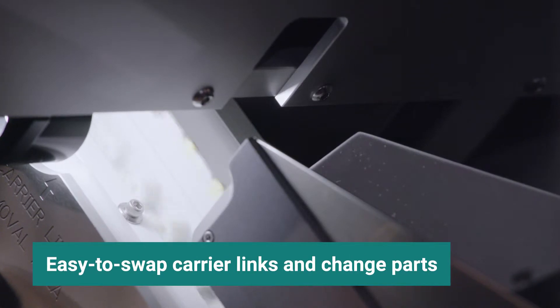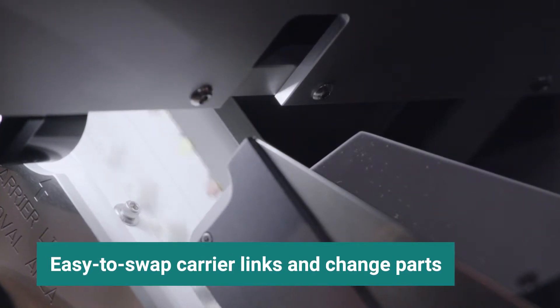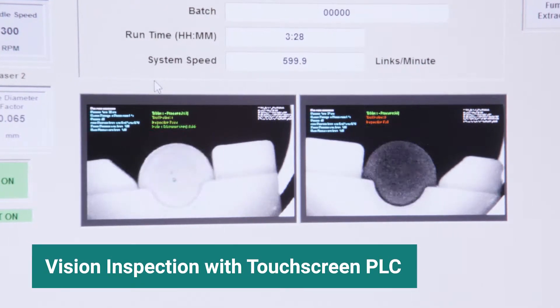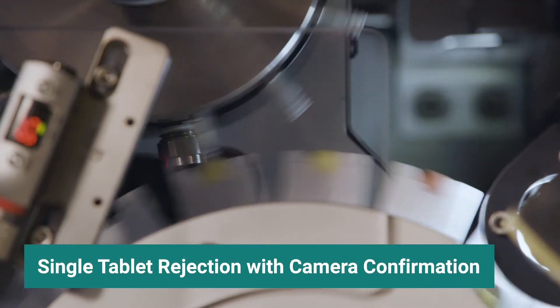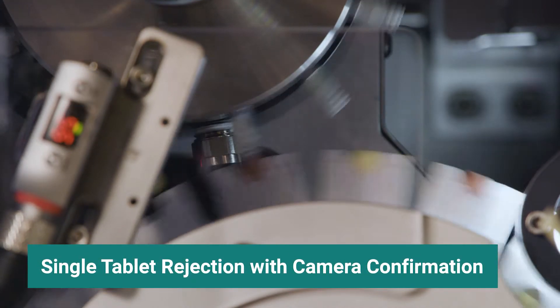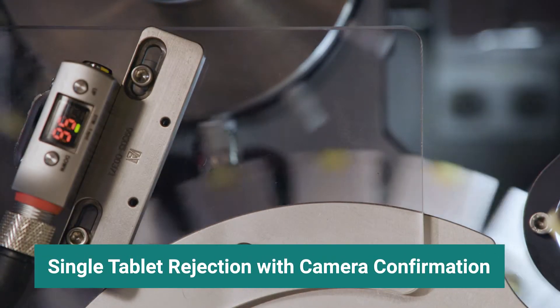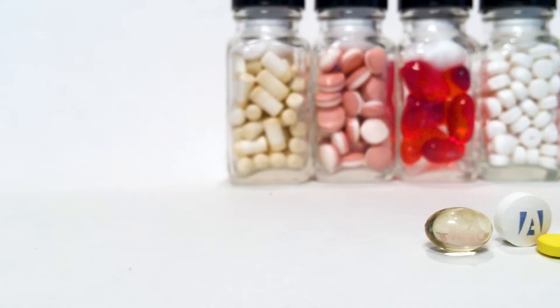With easy-to-swap carrier links and change parts, the superior vision inspection system confirms the presence and diameter of each aperture, while our patented single product rejection system detects defects and removes individual tablets with camera confirmation.